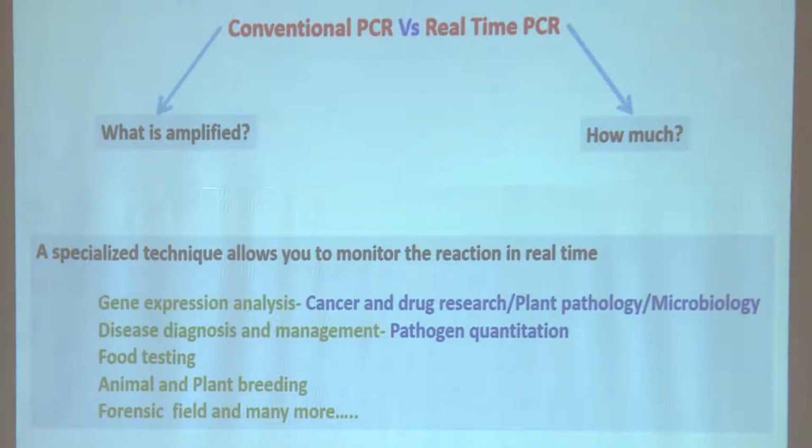In virtually every branch of biology we have an application of PCR and an application of real time PCR. Okay. We have applications directly in plant pathology, microbiology, pathogen quantitation, microbial load estimation. So, and the list goes and goes and goes.